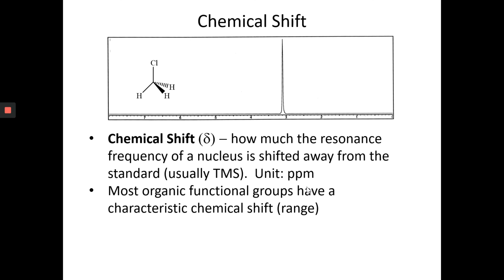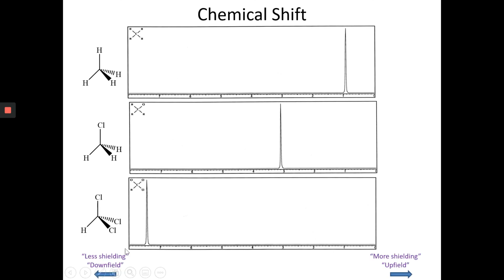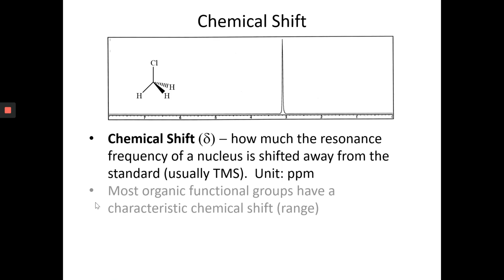For example, the one we just looked at, a chemical shift between 7 and 8 created by 3 chlorines, doesn't appear anywhere on there. So be a little cautious in using the back of that table. Just because it's not there doesn't mean it doesn't exist. So I usually use the front, where it says organized by structure.